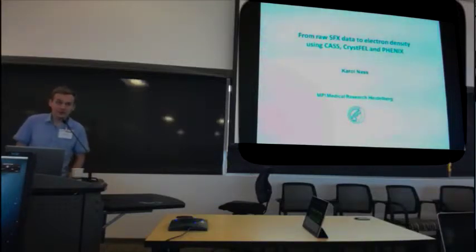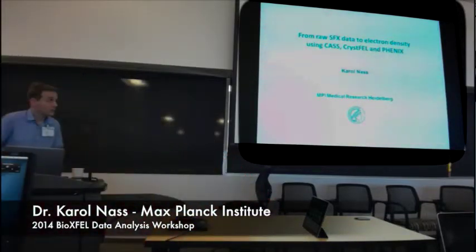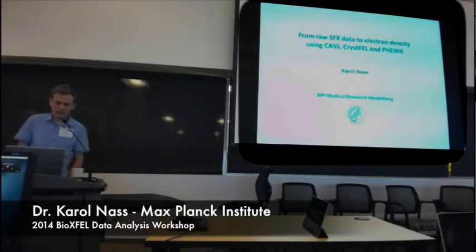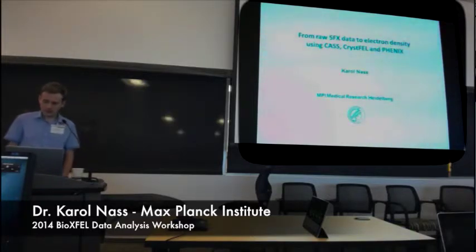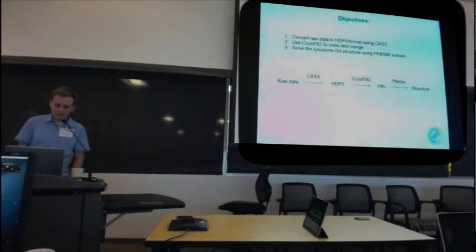We are switching the topic from Cheetah to CASS, and in these few slides I'm going to give you the idea on how to go from the raw SFX data to electron density using CASS, CrystFEL, and PHENIX. The data will be the lysozyme gadolinium. The objectives of this tutorial are, first, to convert the raw data that you record at LCLS, for example.